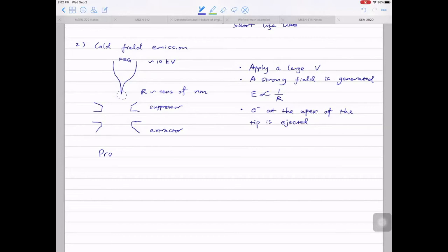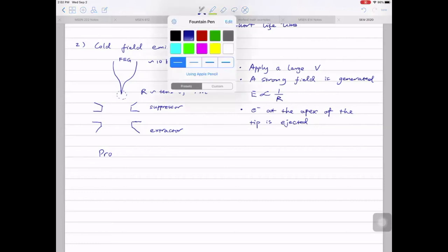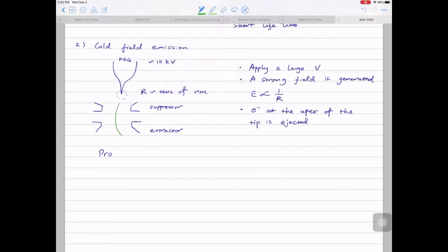So what this setup is trying to do is to make electrons cross or focus to a single point for the first time before they focus again along the optics. Does this make sense? Okay, thank you.